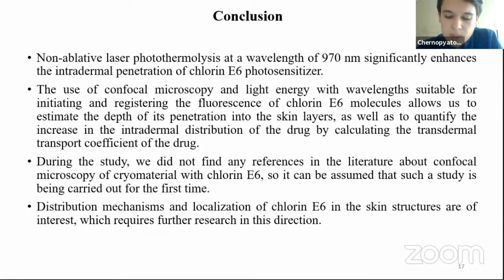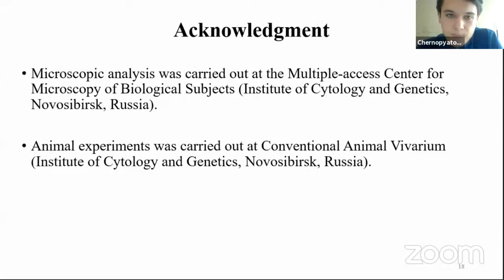Distribution mechanisms and localization of chlorin E6 in the skin structures are of interest, which requires further research in this direction.